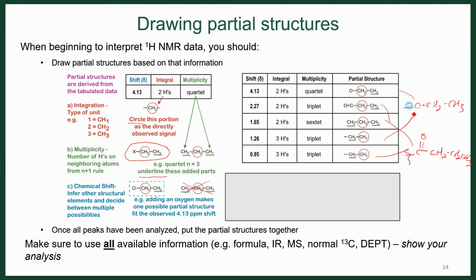And we can see that what we have remaining here are two bonds that need to be connected together, and we would end up with our final structure associated with this individual molecule.